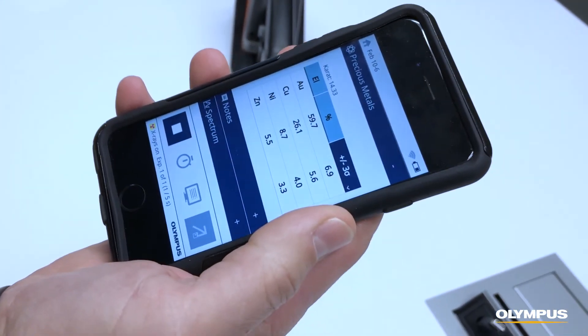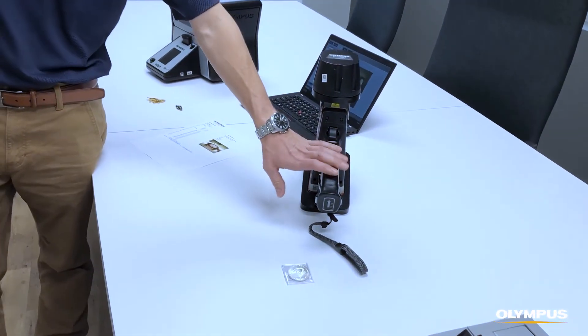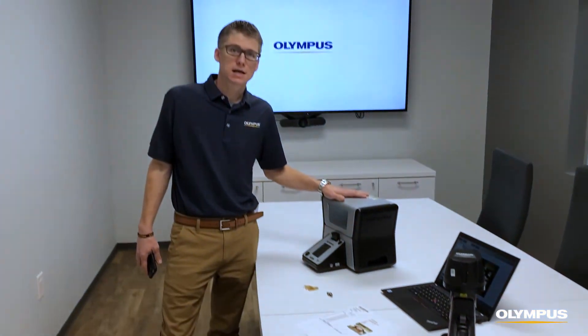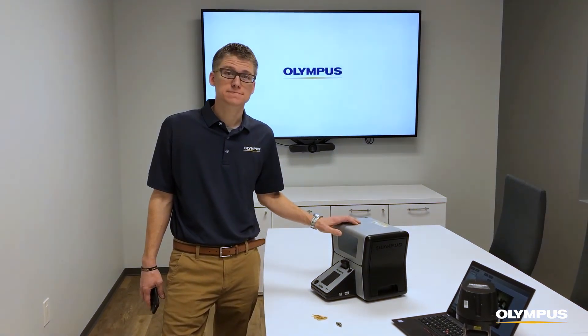You can see your results in real time by using our phone app, which will show you the instrument results the same as they would be on the instrument screen. So regardless of whether you want the features of a handheld and portability or an all-in-one benchtop analyzer, Olympus offers accurate non-destructive analysis for your precious metals testing.